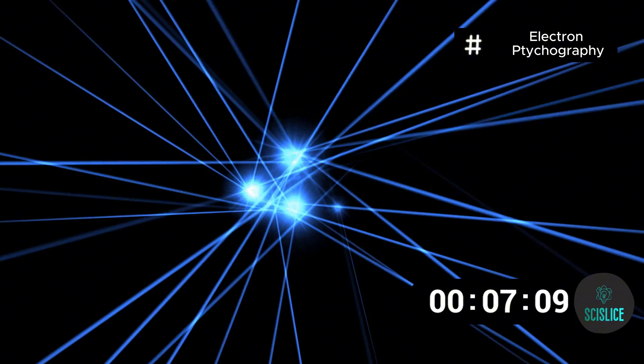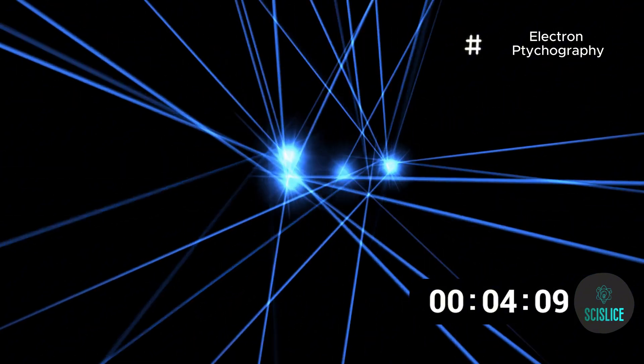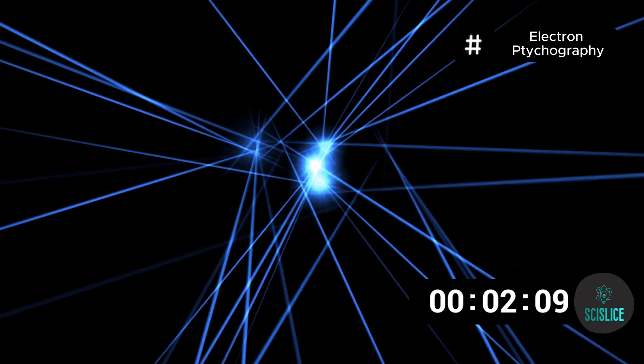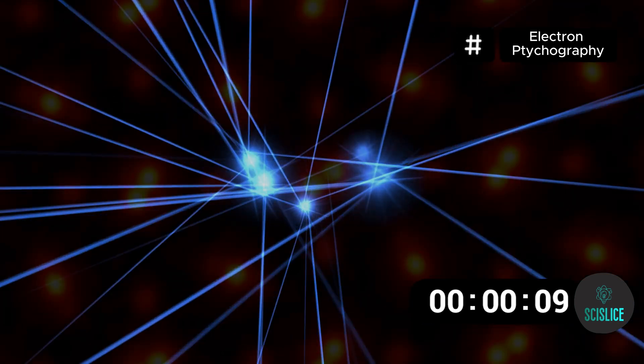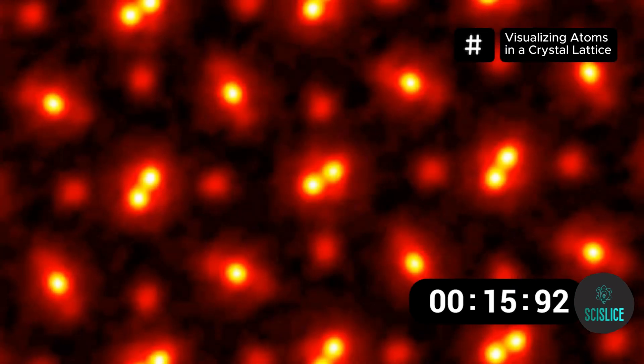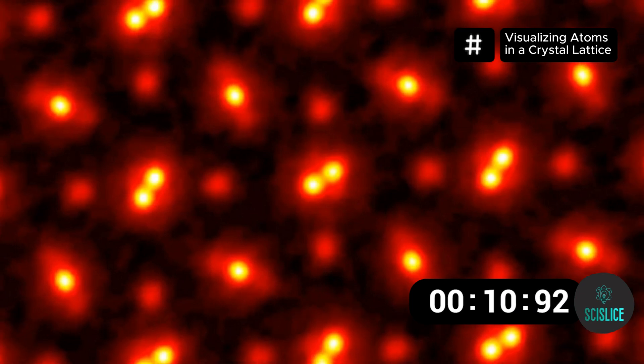By analyzing the pattern created by these scattered electrons, scientists can reconstruct an image of the atoms, revealing their precise locations. The dots you see in the image are the individual atoms of praseodymium orthoscandate arranged in a crystal lattice, each bright blob represents an atom.